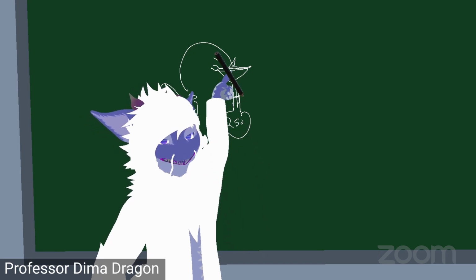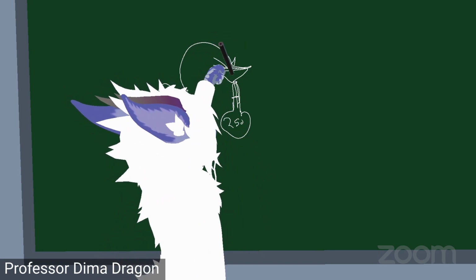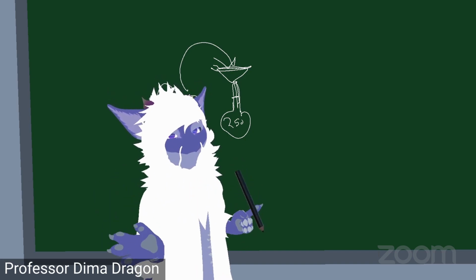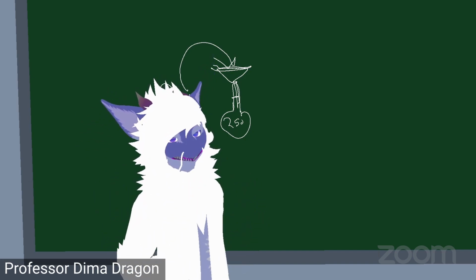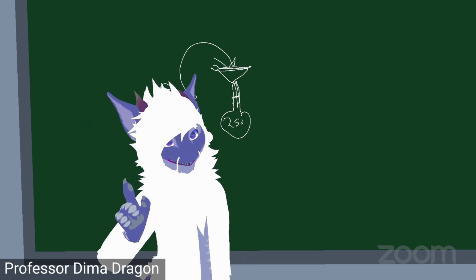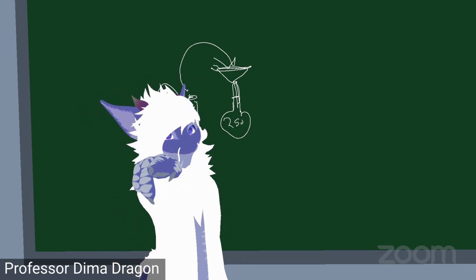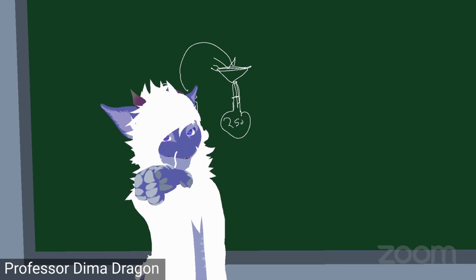So you're going to have the black or brown gunk that's going to be in this filter, and you're going to be filtering that down like coffee. You don't want to get any of the coffee grounds in your coffee. You don't want to drink that, right? And the LC doesn't want to drink that either. So you guys are going to make sure that the LC doesn't drink coffee grounds.